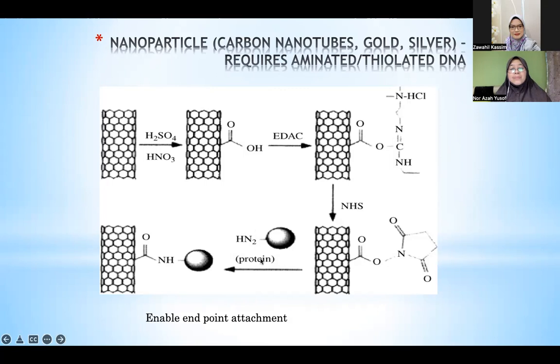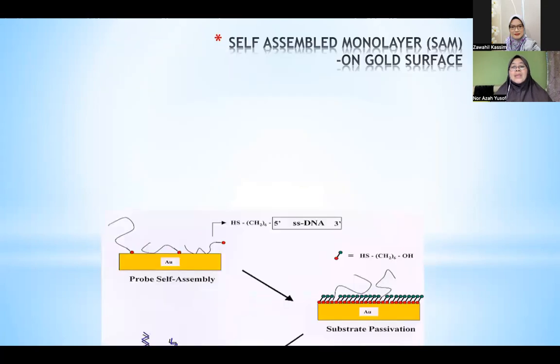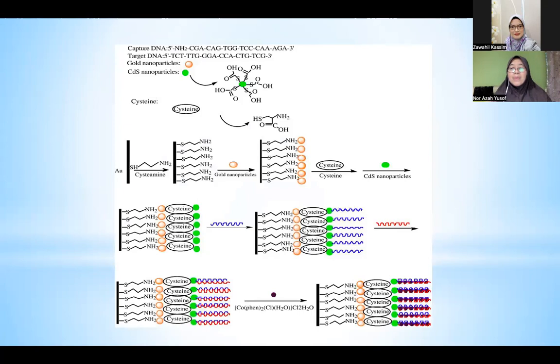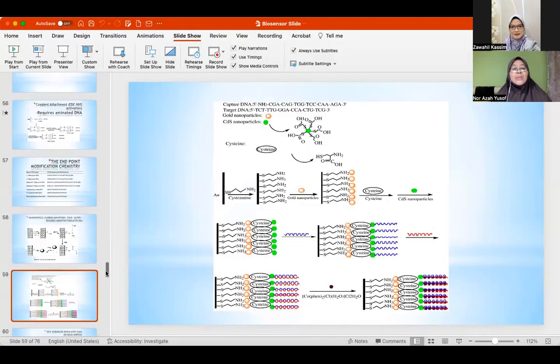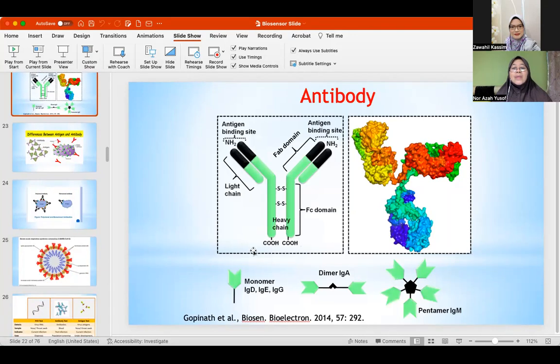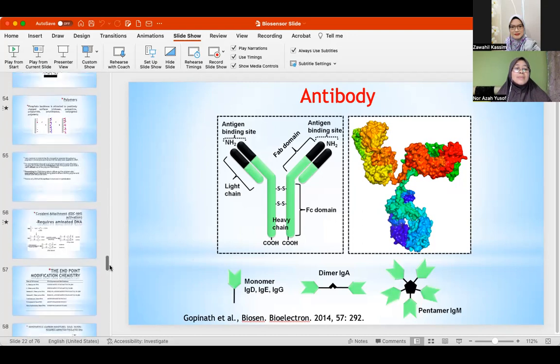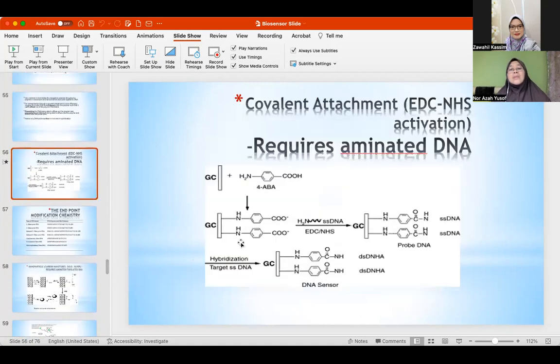So apart from DNA, we have to think about, for example, if we wish to attach other proteins. What about if we have antibody? Okay. So antibody, because we need to attach the carboxyl part, if you remember that. How do we attach the carboxyl on the surface of the sensor? Instead of using amine just now, instead of using carboxyl, we can replace this with amine. Okay, let me go back. Because carboxyl reacts with amine to form amide.